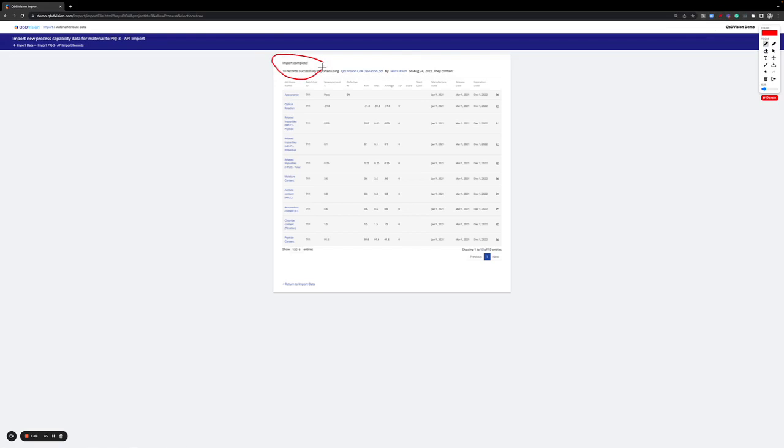Now you can send that draft for approval, or you can open it up and review the data for any outliers. Try it out today and see how fast you can turn your data into powerful information.